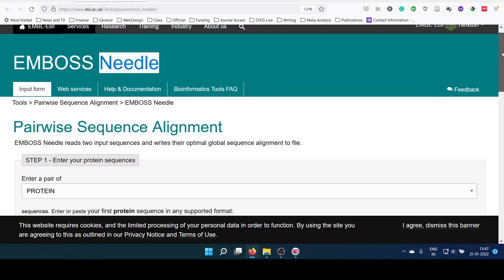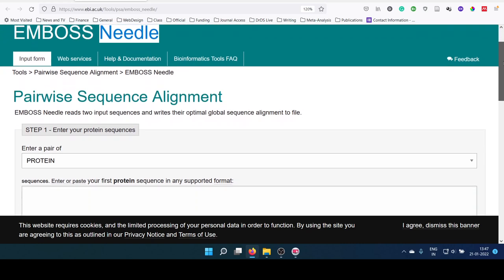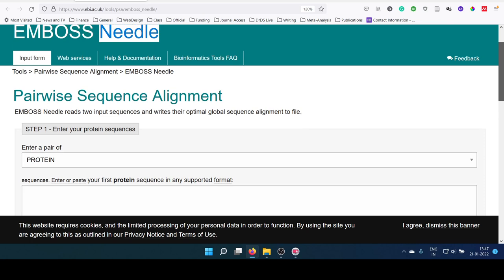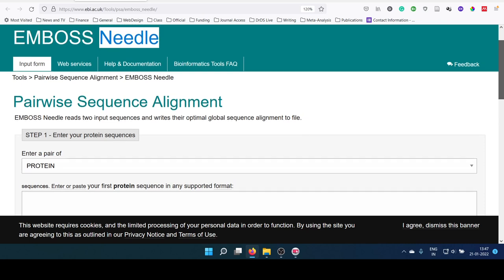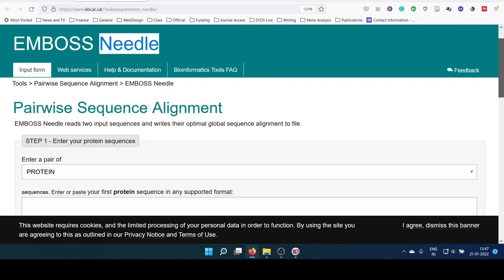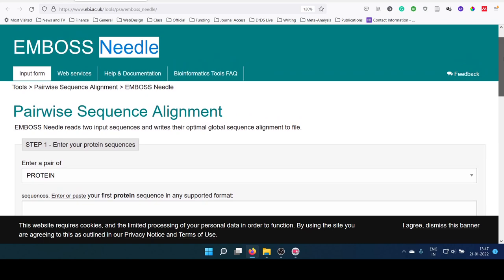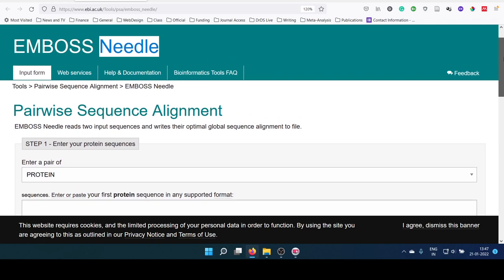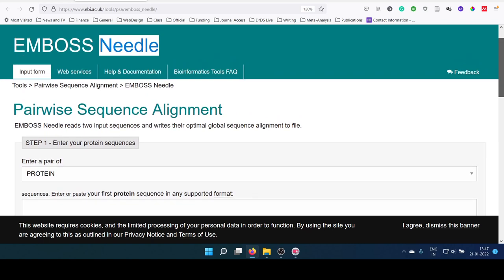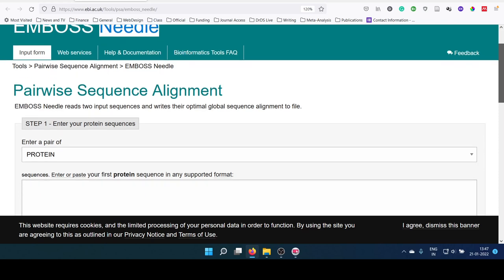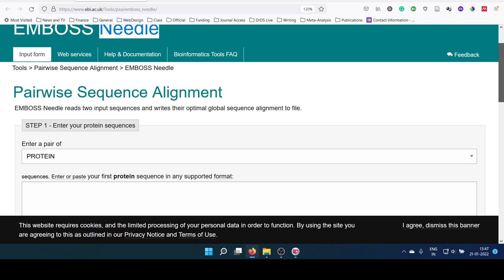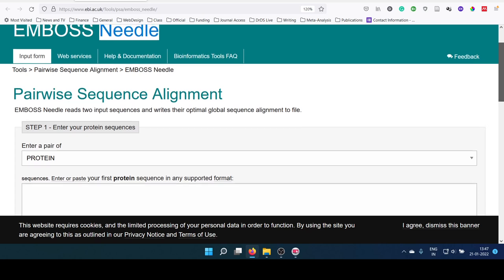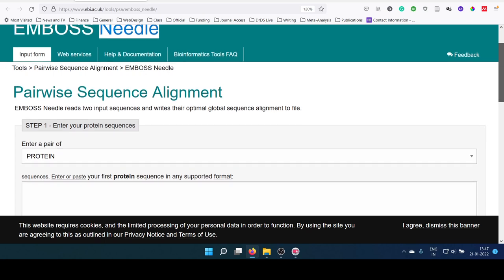EMBOSS is a collection of different tools for analyzing sequences. This EMBOSS package has a program known as Needle, which works on Needleman-Wunsch algorithm for performing pairwise sequence alignment.